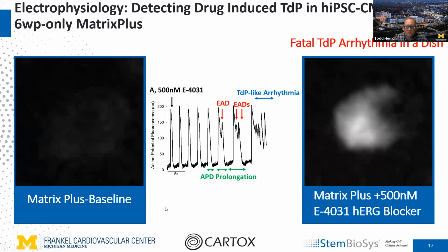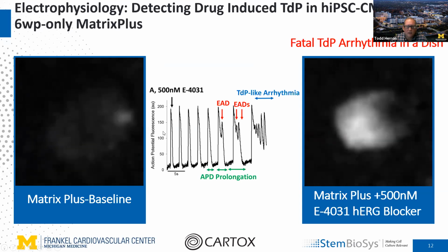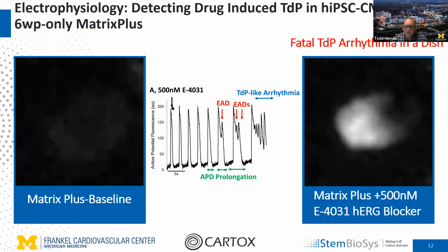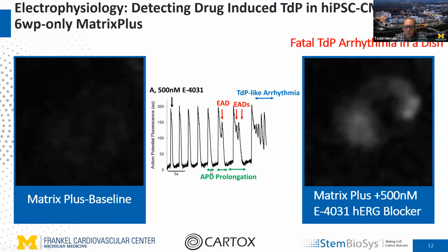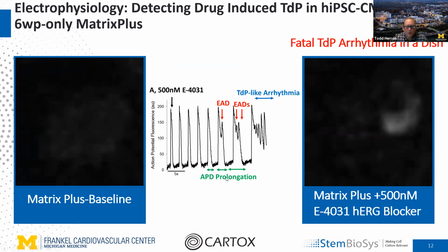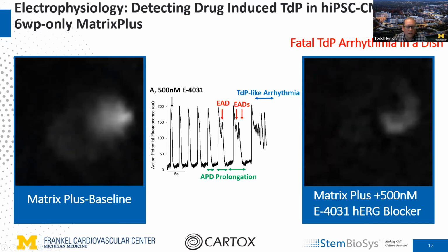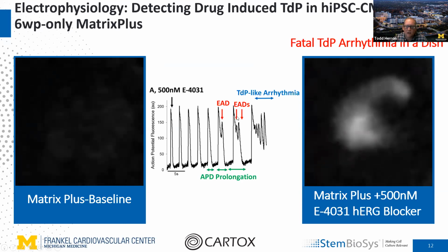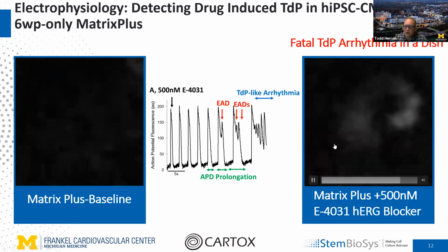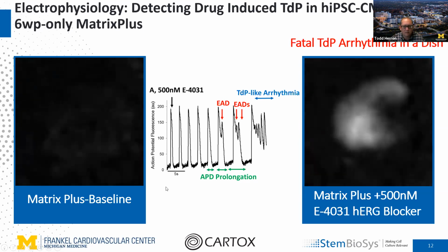The plot in the center shows the time course of the effects of E4031 to cause arrhythmias. So here you can see the application of E4031 after the first beat. And then after about 4 beats, we could start to detect action potential duration prolongation, which progressively increased and also coincided with the occurrence of early afterdepolarizations, which you see here labeled in red. And then finally, what you see in the movie as the stable rotor is a TdP-like arrhythmia, which was maintained very stably.